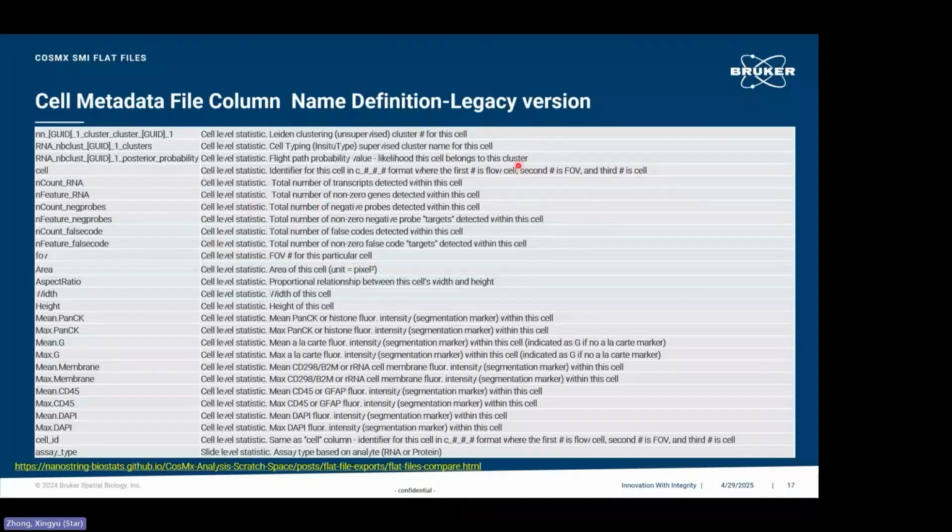There is also a legacy Excel table. I think our local FAS have this legacy Excel table, and it also has the metadata column name definitions. You can reach out to your local FAS to get this Excel table and check the definition of each column name.